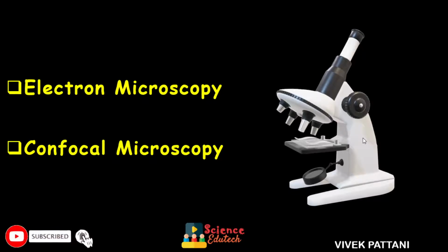In the biomedical sciences, the major application of confocal microscopy involves either fixed or living cells and tissues that have usually been labeled with one or more fluorescent probes. So this is the basic introduction of electron microscopy and confocal microscopy.